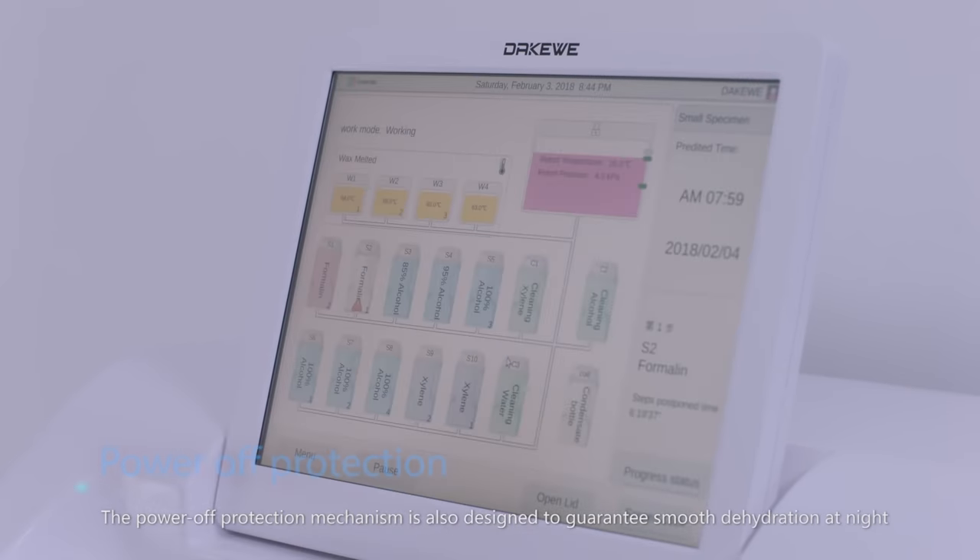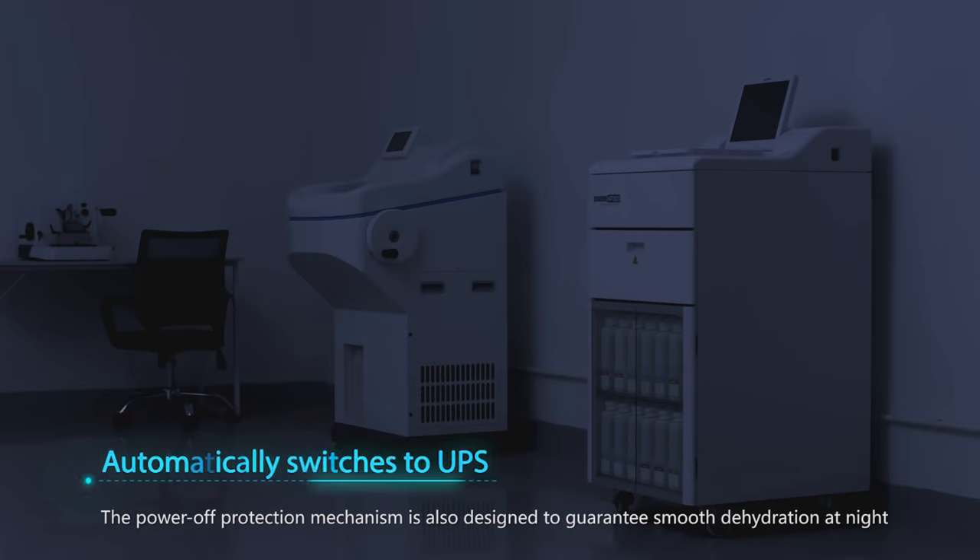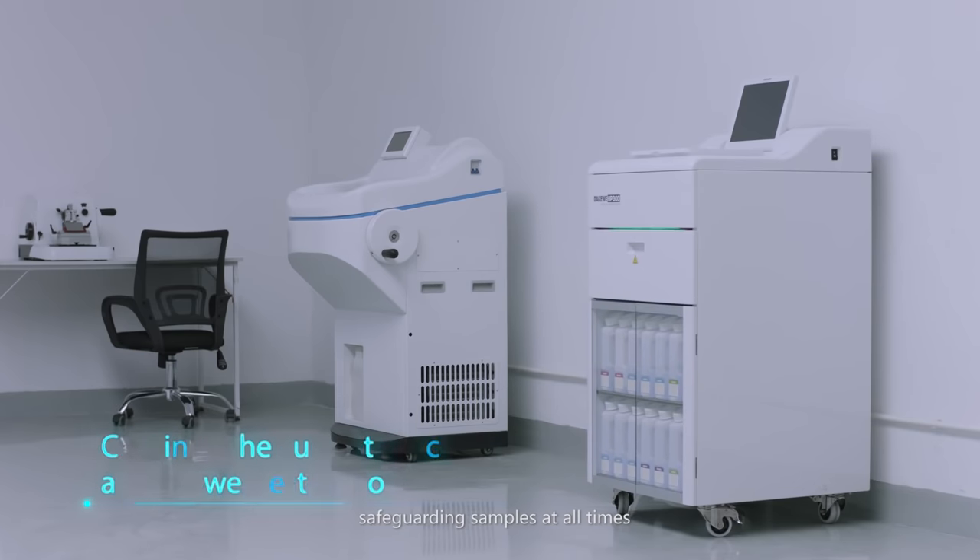The power-off protection mechanism is also designed to guarantee smooth dehydration at night, safeguarding samples at all times.